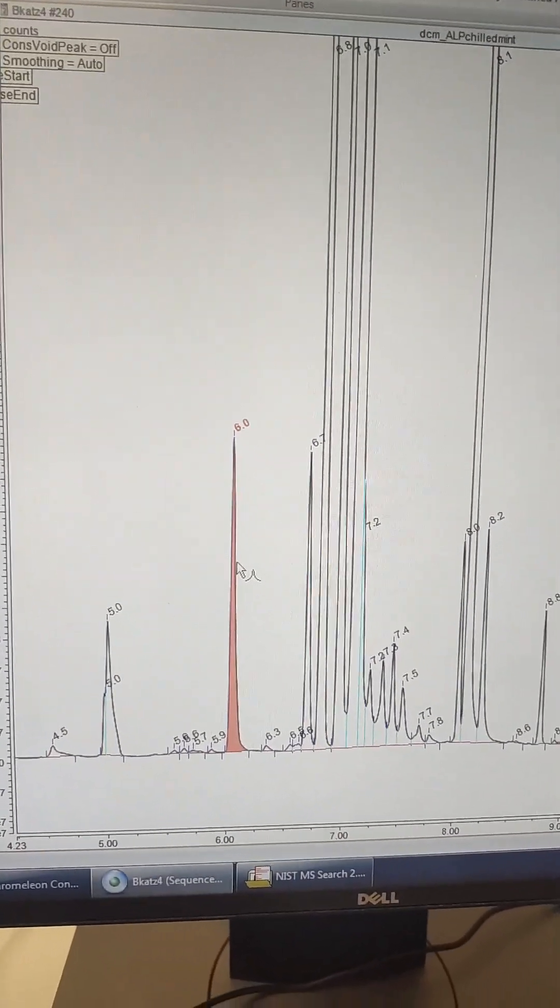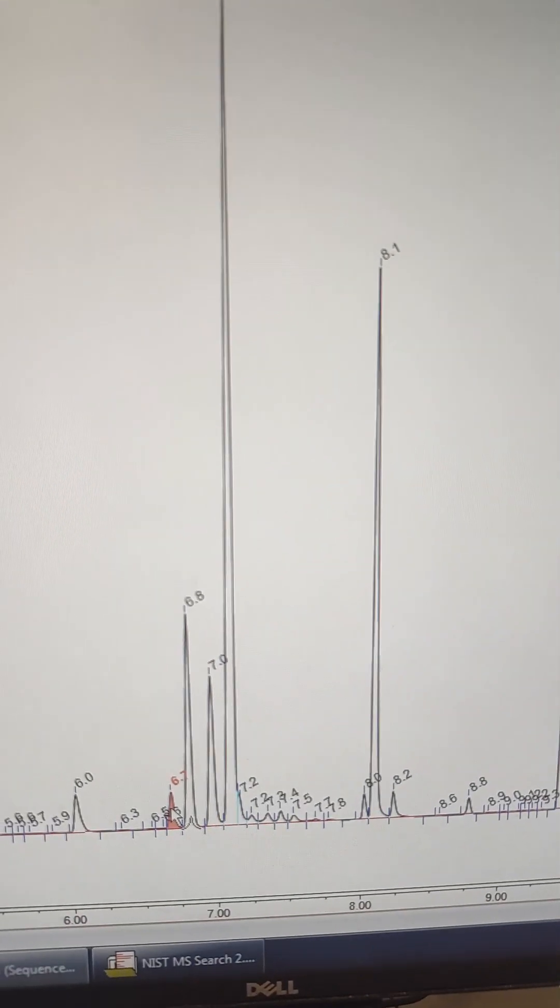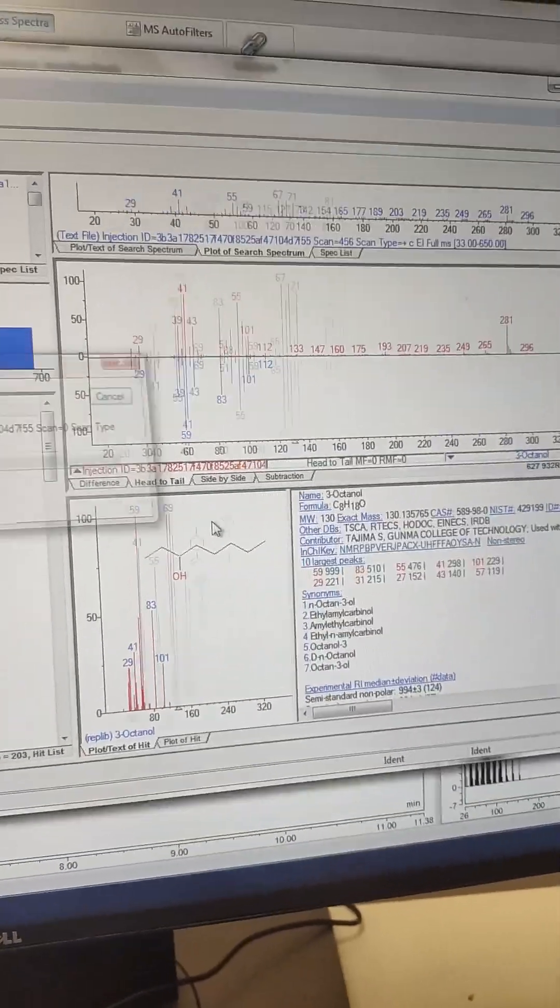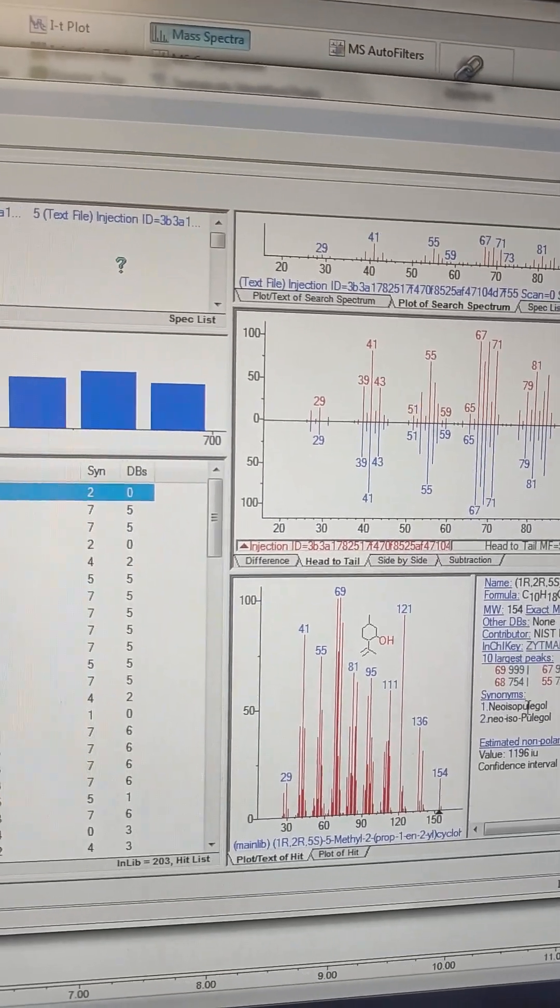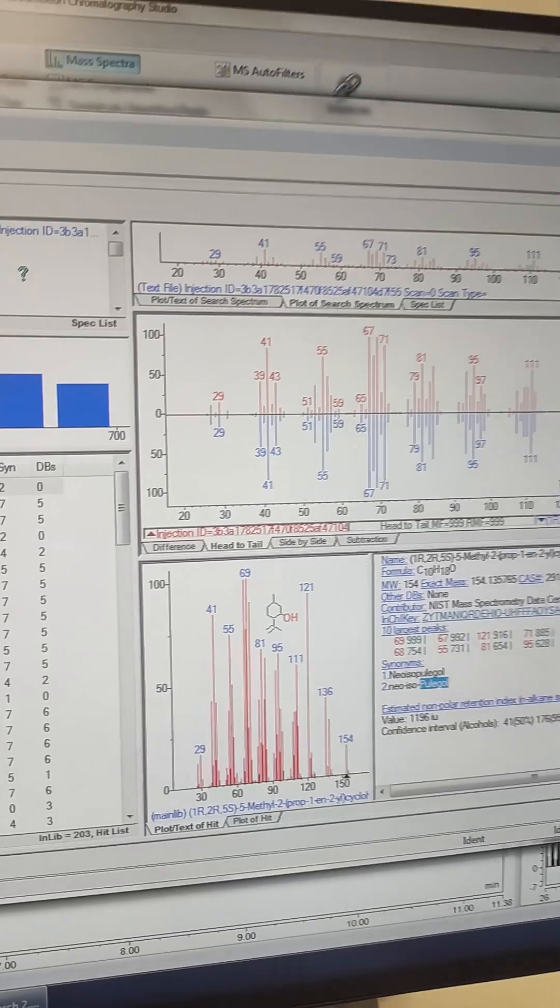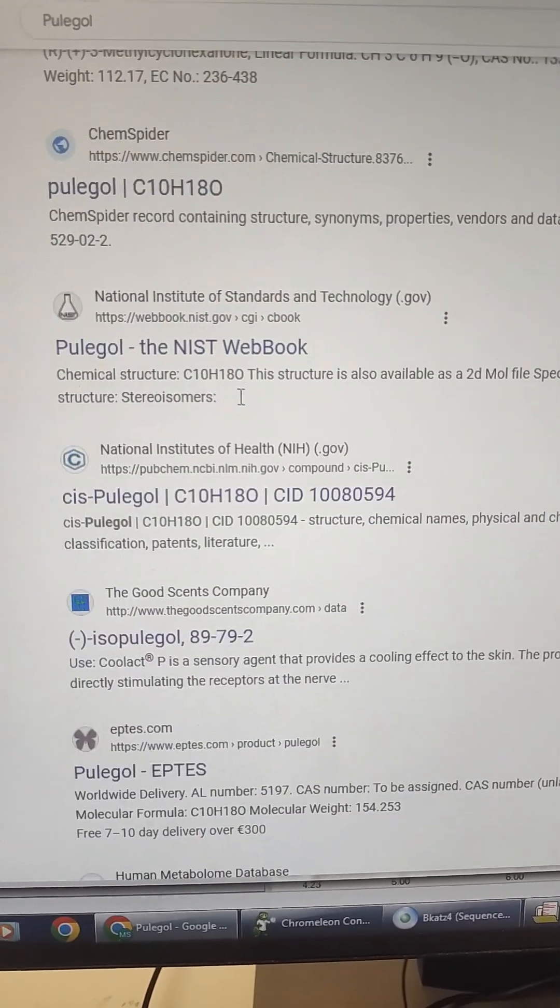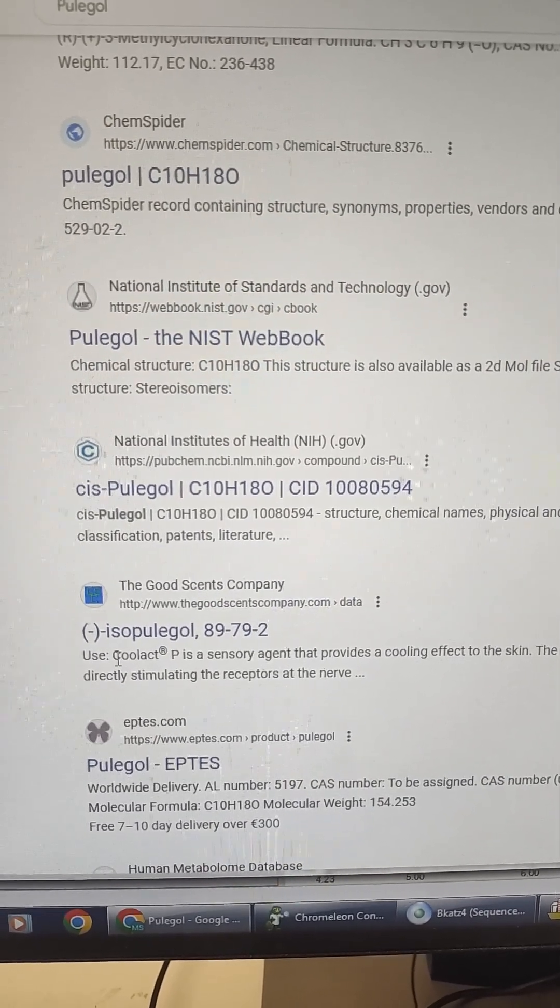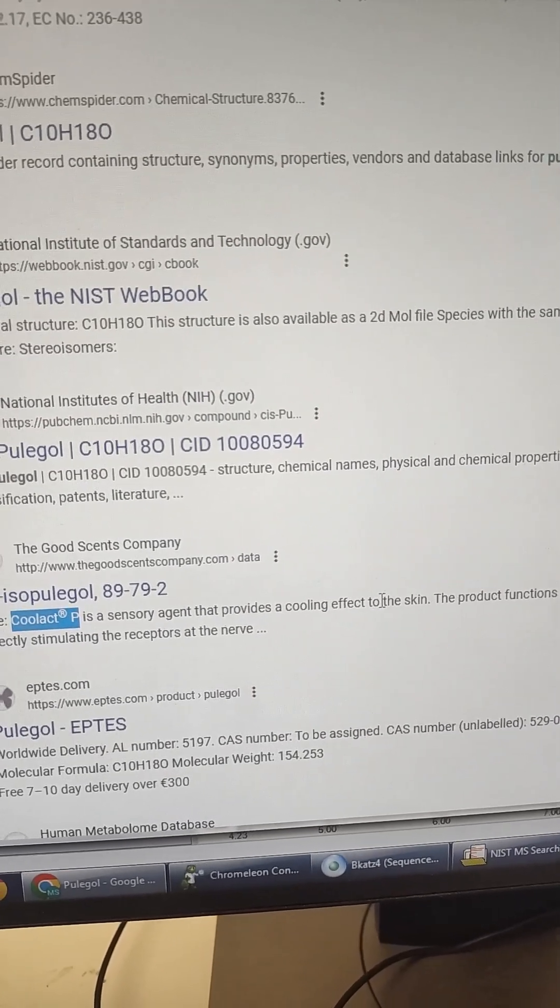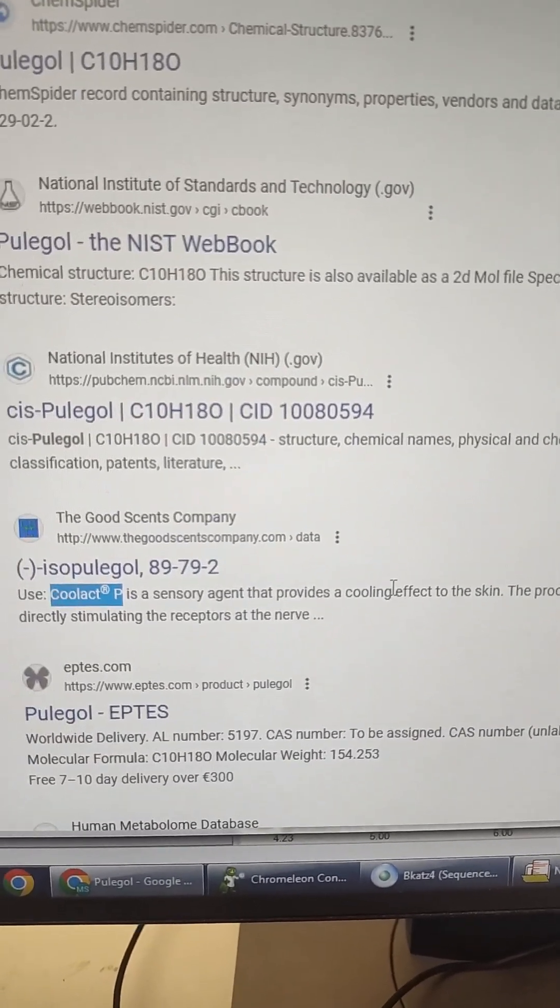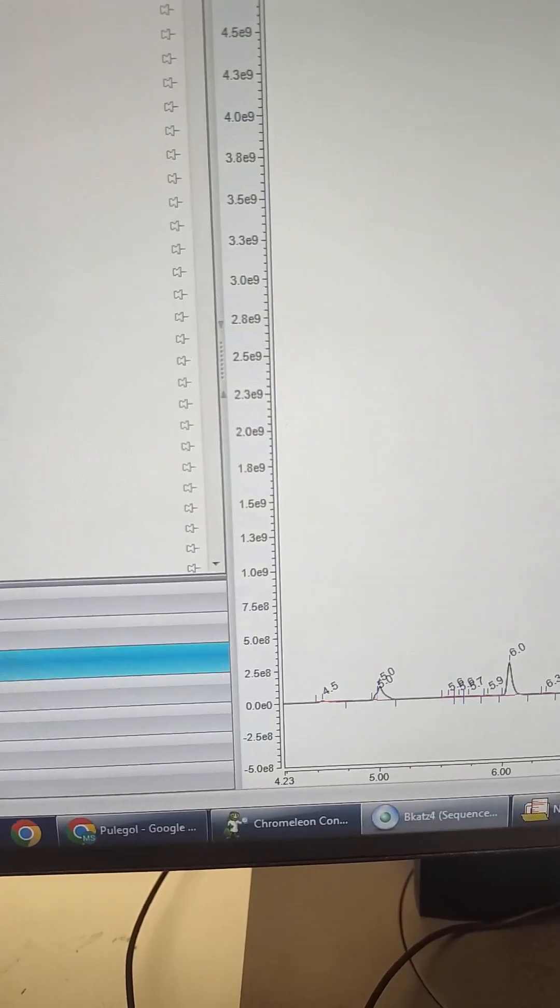All right, so here we go. Now at 8, what is this, 6 minutes we got linalool, that guy. That guy tastes a lot like a Fruit Loops flavor. And then we got here at 6.7, this is a big one, this is probably another menthol derivative. That's, oh no, that's isopulegol, pulegone, pulegol. I don't like pulegone, but this is the pulegol, see if that's carcinogenic. We're definitely seeing some pulegol. Oh, isopulegol, it is called Cool Act P, is a sensory agent. Wow, I've never seen this one before, that's really unique. Provides a cooling effect to the skin. This is a really different product to tell you the truth, but this is definitely looking like a synthetic Cool Act P is in the ALP pouch. Really interesting, I'm glad I ran these, this is definitely unique.